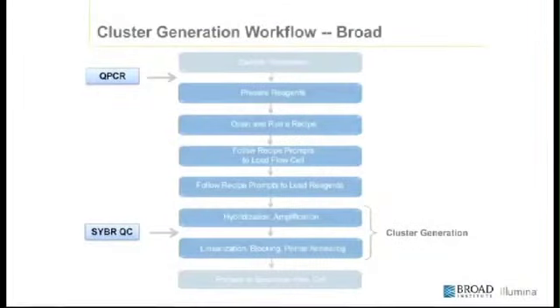As we described in the classroom presentation, we perform a QC step after cluster amplification, before linearization, using SYBR Green intercalating dye to visually check for double-stranded clusters. This allows us to be sure that amplification was successful and that the libraries were loaded at proper concentrations. We can also identify mechanical problems with our cluster stations.